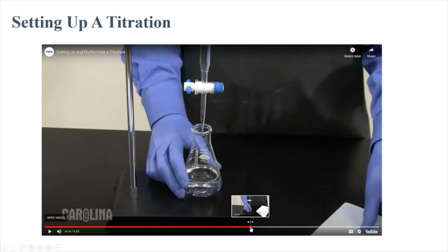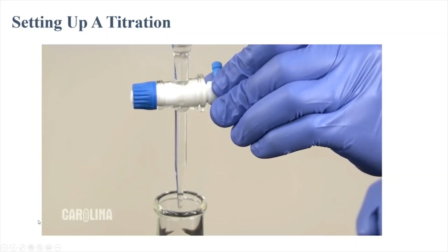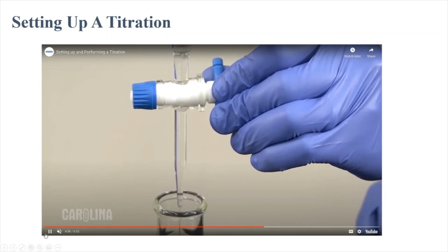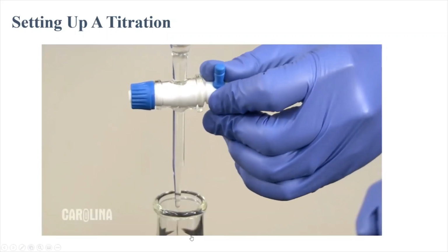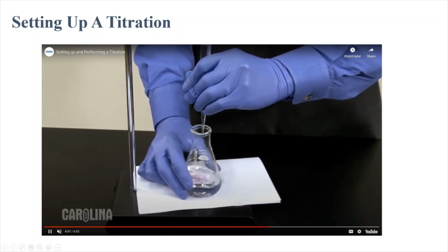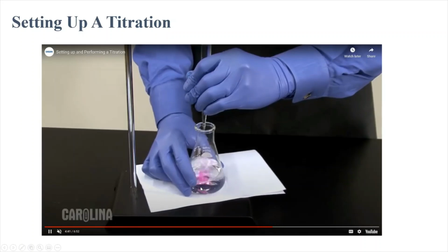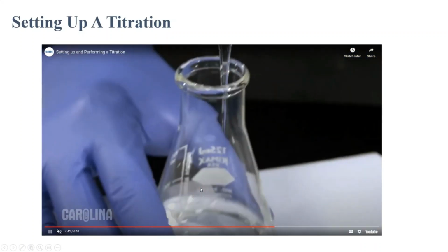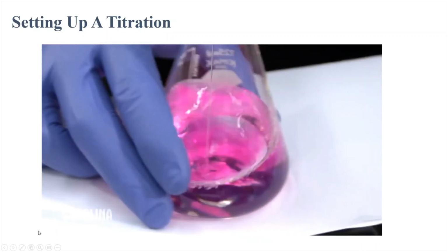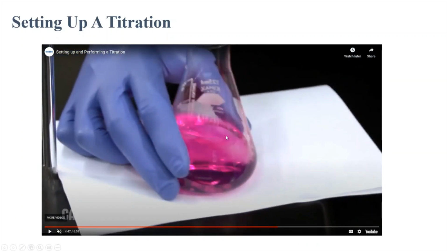So in this case, he adds the titrant. Familiarize yourself with how quick. He's just putting it in real fast. And you can see that when he's done, we'll take a look when he finishes here. When he's done, he gets this really bright pink solution.